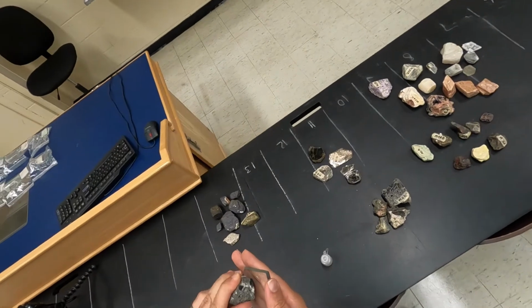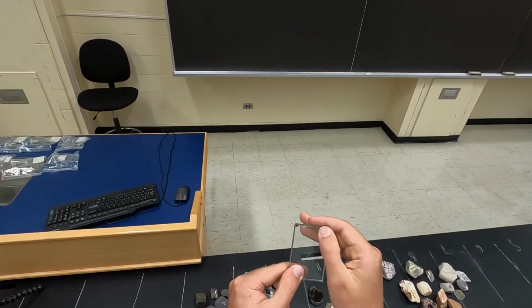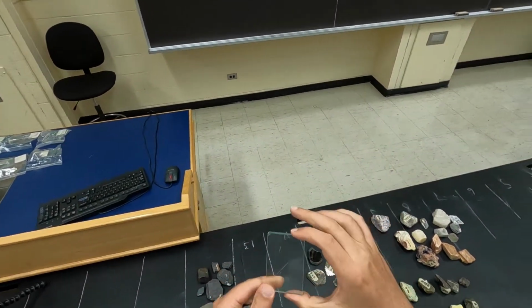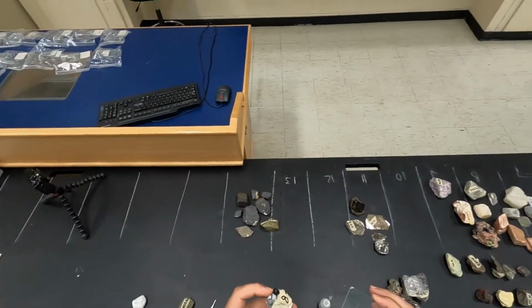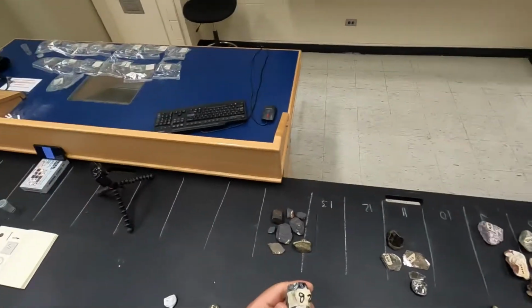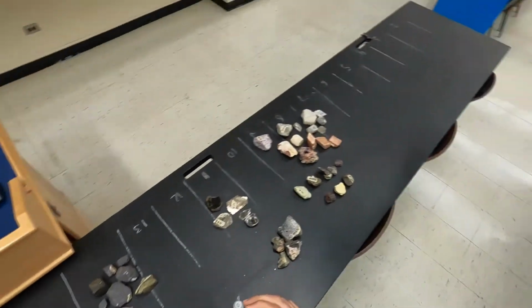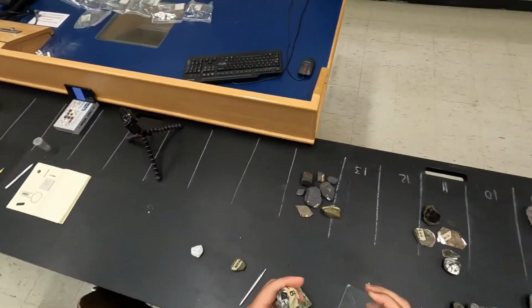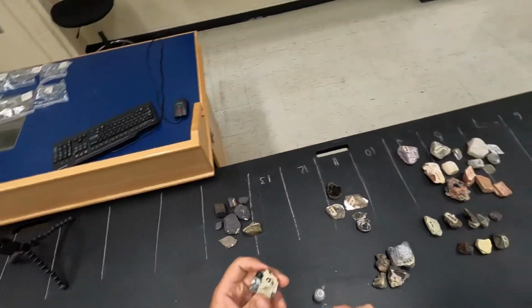and test for its hardness. Usually spinel is quite hard, and you can see a clear scratch. So comparable to quartz or even higher, sometimes the spinel can go really high. In fact, it's used as a gemstone quality material. So you can think of varieties such as sapphire.